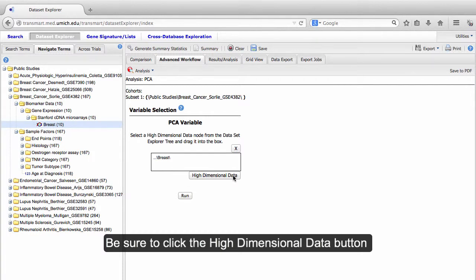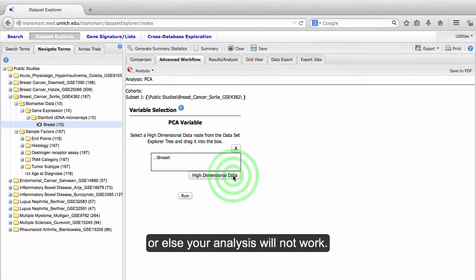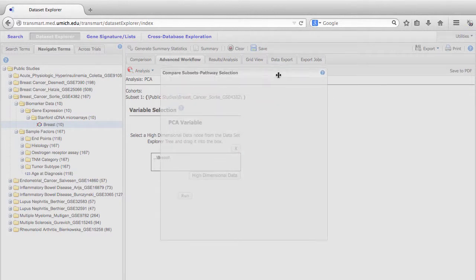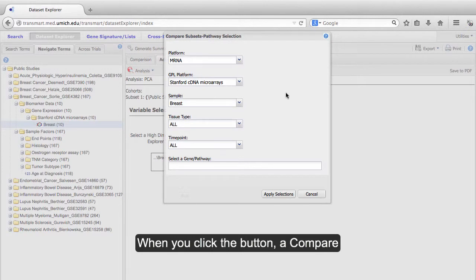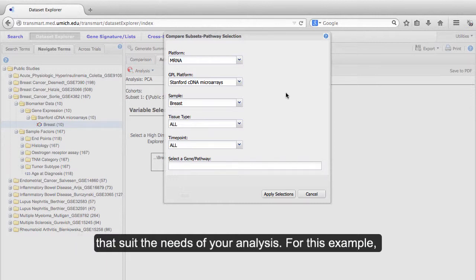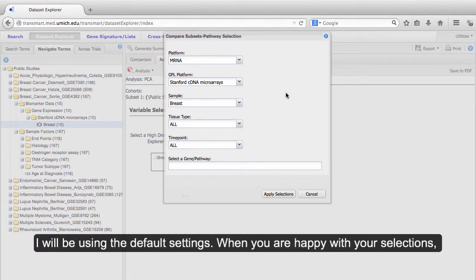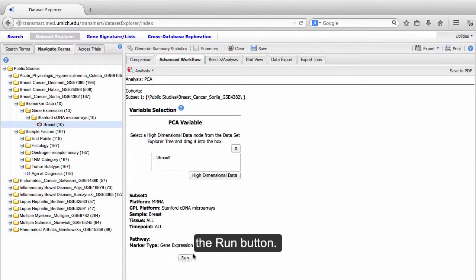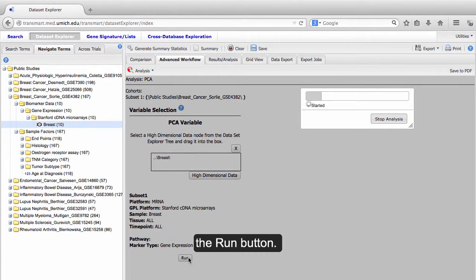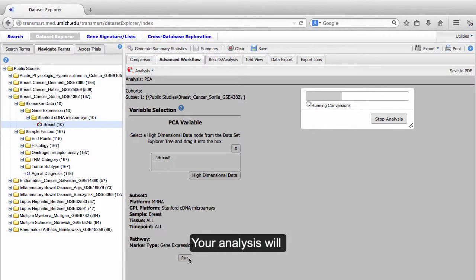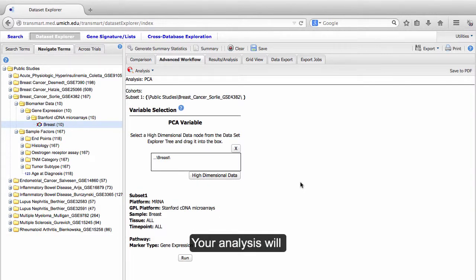Drag the high-dimensional data into the PCA variable box. Be sure to click the High-Dimensional Data button, or else your analysis will not work. When you click the button, a Compare Subsets Pathways Selection popup will appear. Make selections that suit the needs of your analysis. For this example, I will be using the default settings. When you are happy with your selections, click the Apply Selection button. Now click the Run button. Your analysis will take a moment to process.